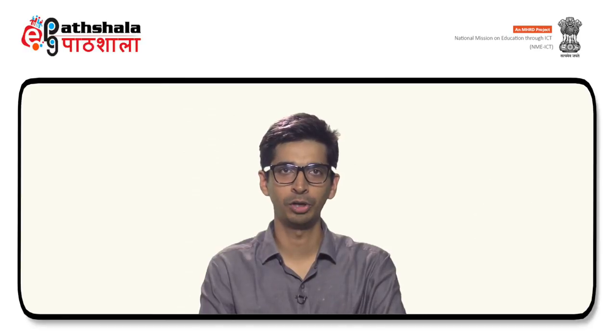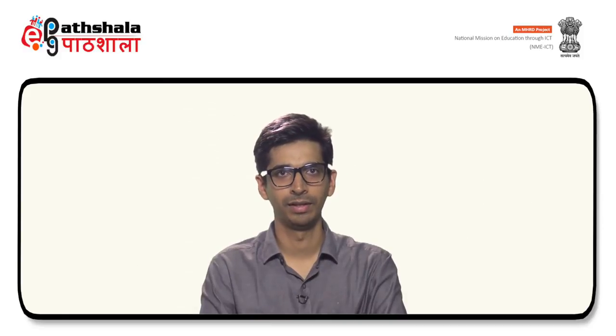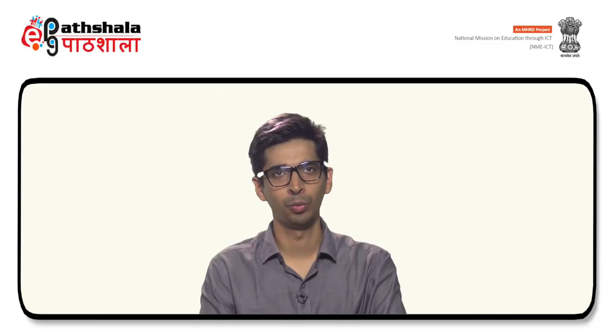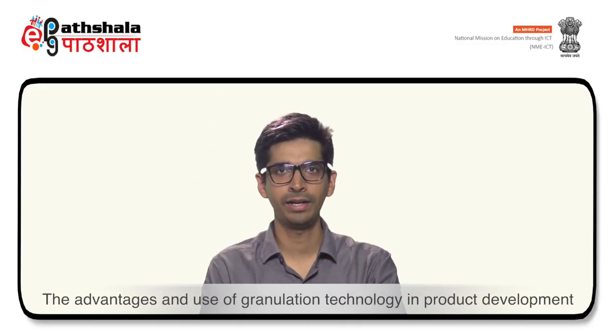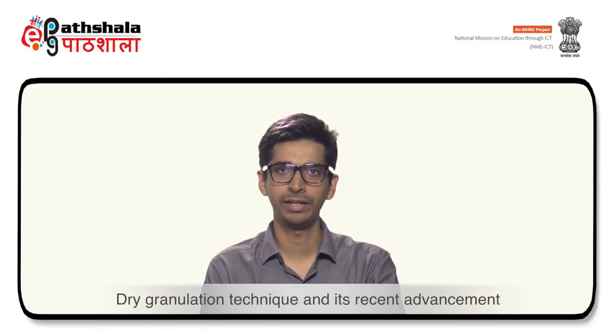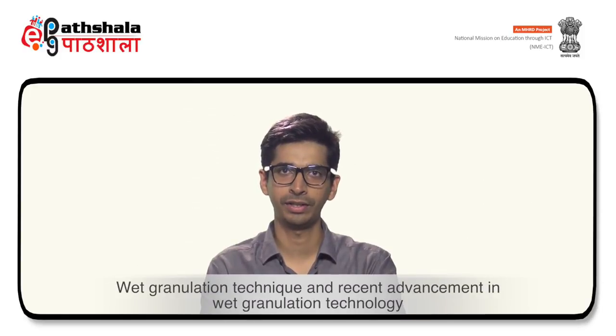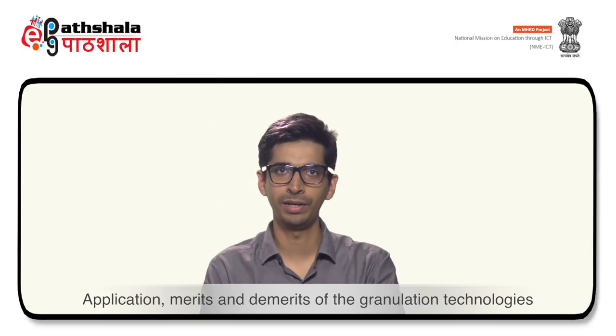Today we will discuss the module Granulation Technology under the paper Product Development Part 1. In this module we learn about: 1. The advantages and use of granulation technology in product development. 2. Dry granulation technique and its recent advancement. 3. Wet granulation technique and recent advancement in wet granulation technology. 4. Application, merits and demerits of the granulation technologies.